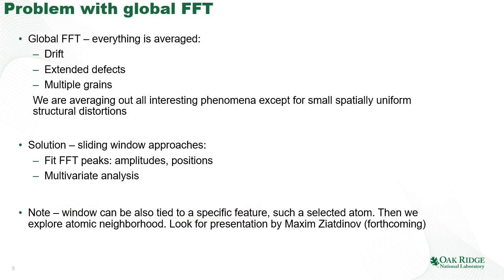The important note here is that the window in the sliding window approach can also be tied to a specific feature. For example, we can develop analysis methods where we identify all the atoms inside the plane and find the atoms of interest and analyze the tiles around those. So this is a great approach to study the atomic neighborhoods of specific atoms. And in one of the subsequent presentations, Maxim is going to talk about the application of this approach. For the time being, let's just talk about the simple sliding window FFT.